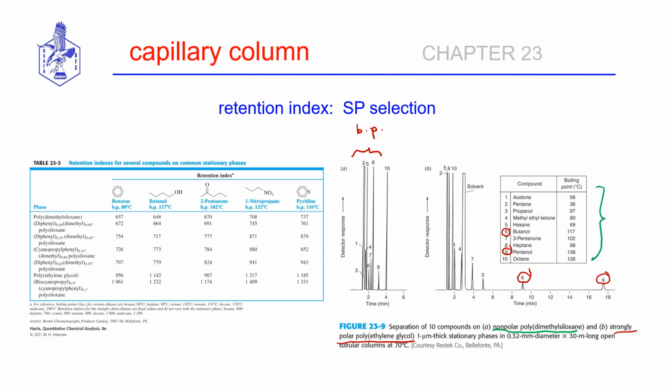So the basis of the interaction with the very polar stationary phase has to do with hydrogen bonding, yielding the longest retention times, and then you have dipole interactions. The polar molecules are coming off intermediate, and then those that only experience dispersion forces are the ones that are coming off fastest.